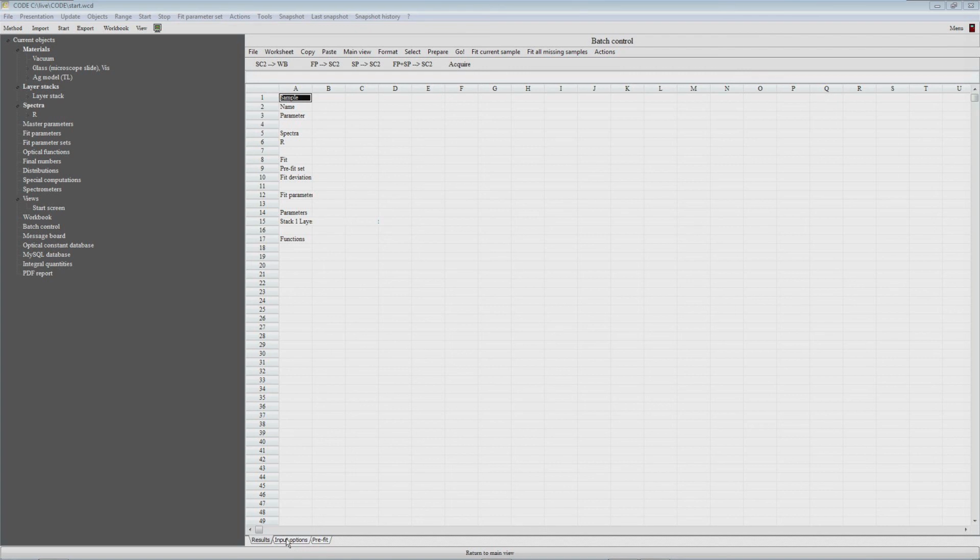So now let's add all the measured data here. We have to do it like this. Here in this results page, in the first column, you have basically a section about the sample where we will have names here, and we can have a line with parameters.